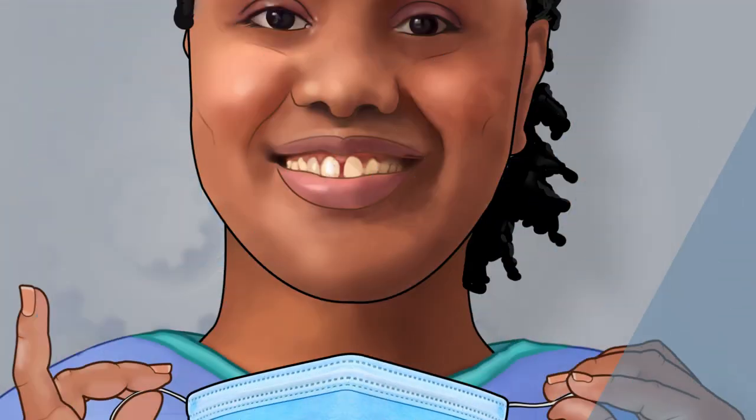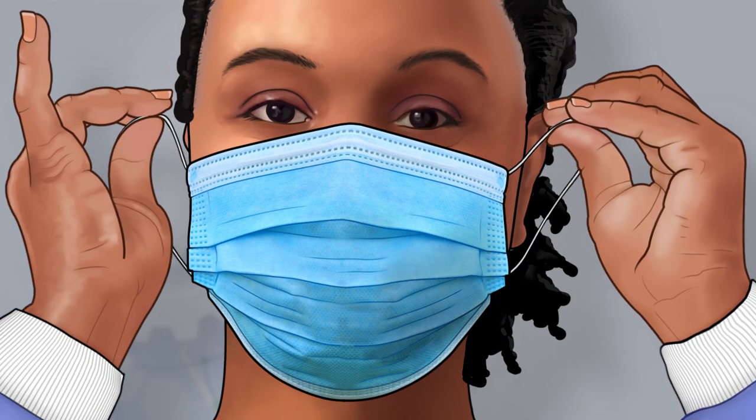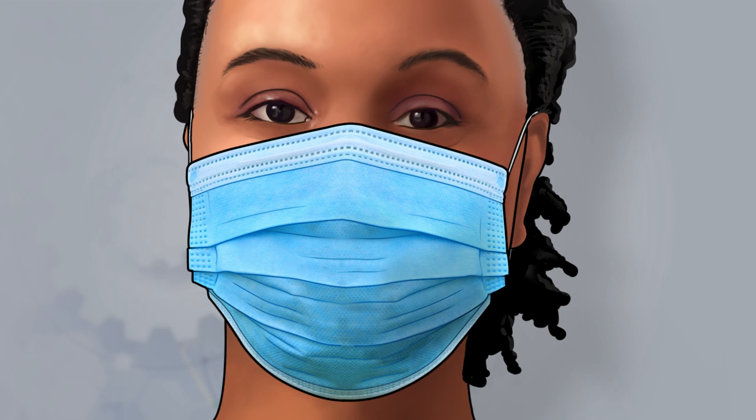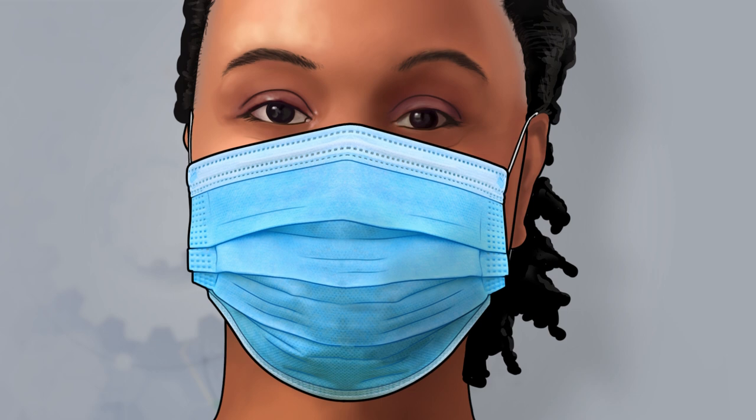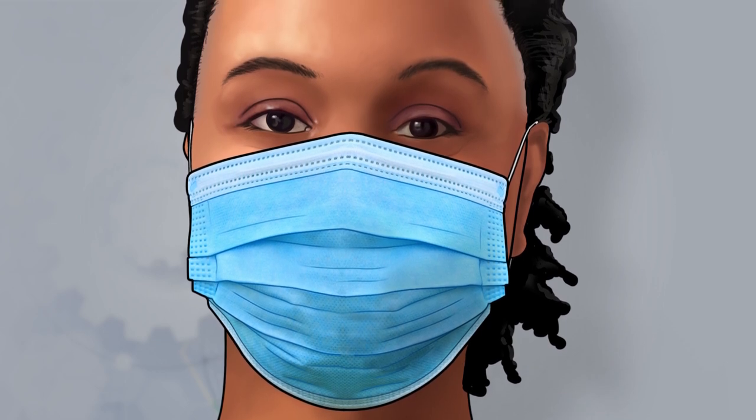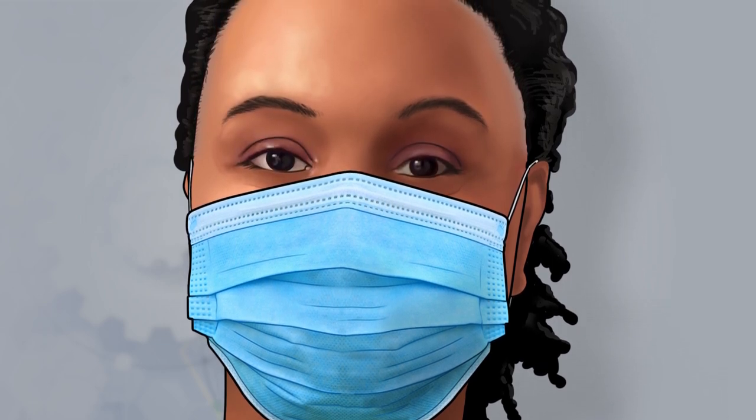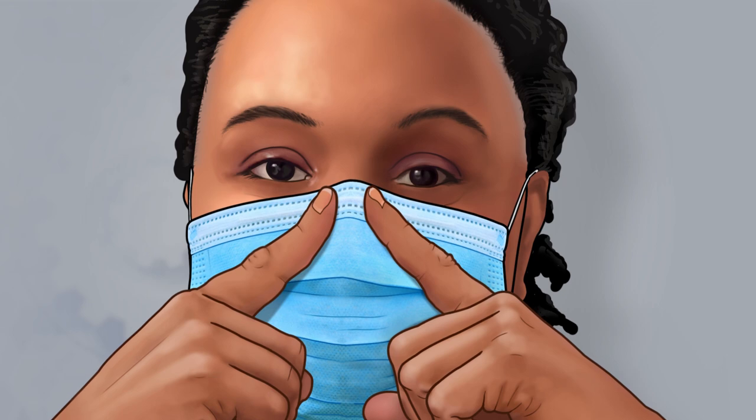Next, put on your disposable face mask with ear loops behind your ears, ensuring a snug fit against your face. With your index finger of both hands, press down on each side of the flexible nose piece so that the top of the face mask fits snugly against your nose and cheeks.